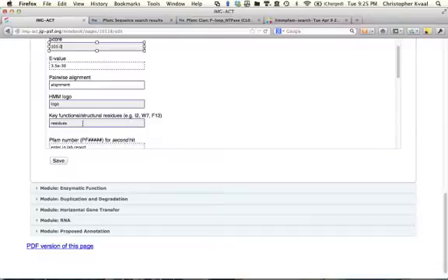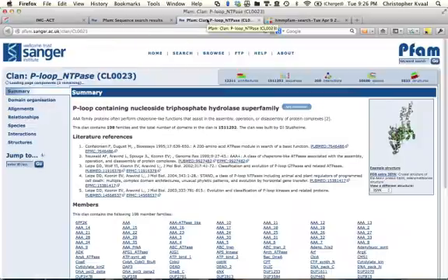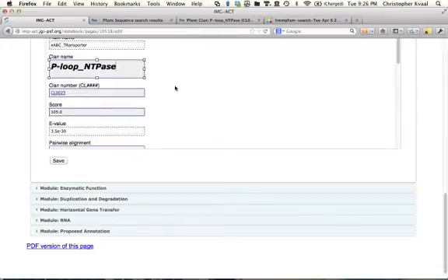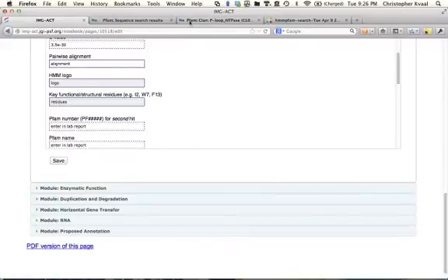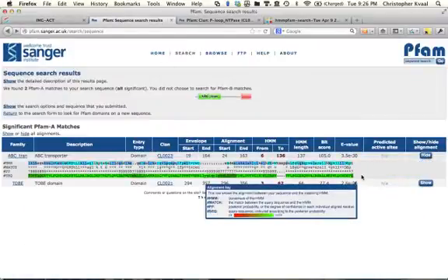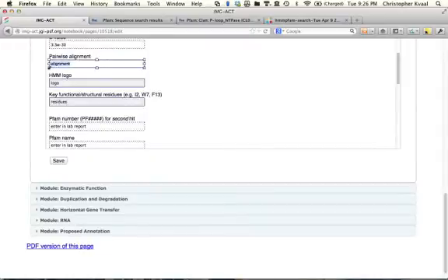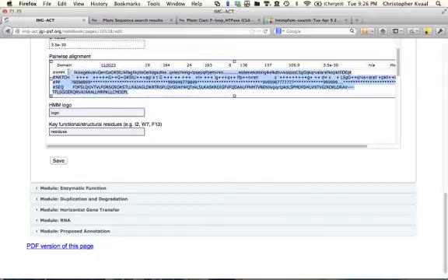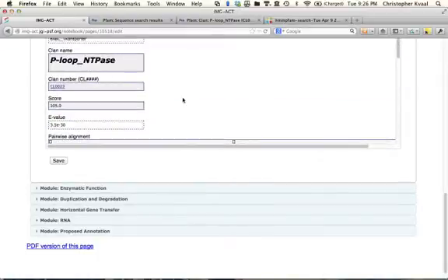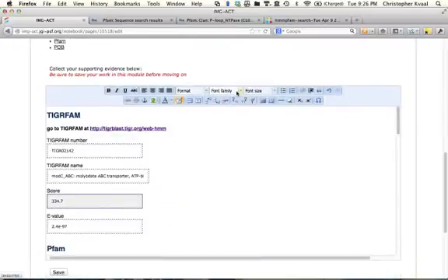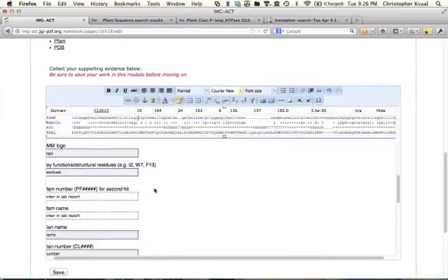Let's go get the pairwise alignment, HMM logo, and key functional residues. I've gotten my clan name and I'll copy and paste it into the box. For the pairwise alignment, I can pull it off right here by showing this alignment. That isn't the prettiest pairwise alignment, but we have that little trick of going into the font family and choosing Courier, which will align it quite nicely.